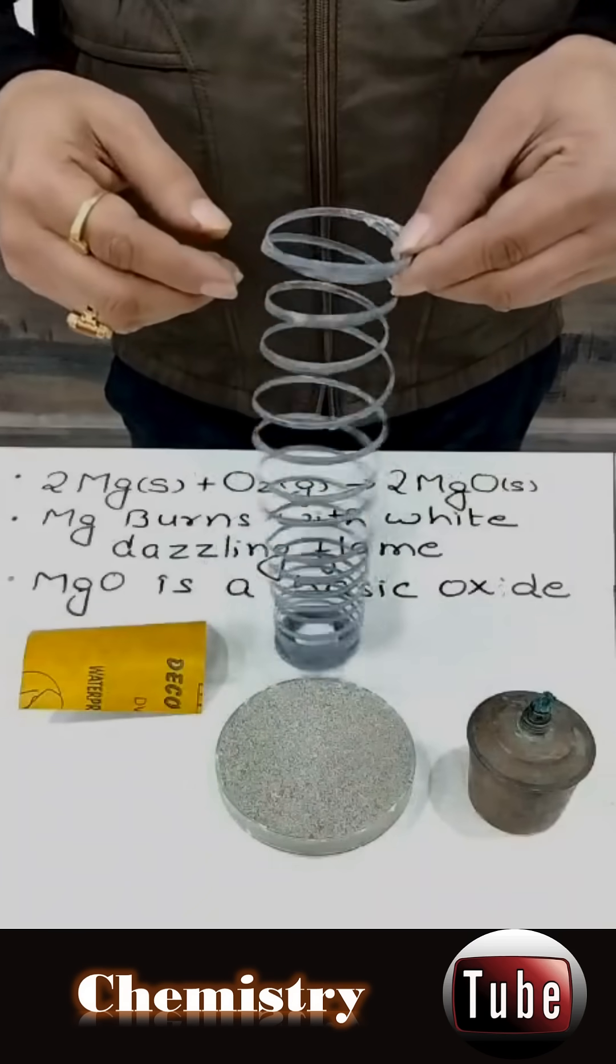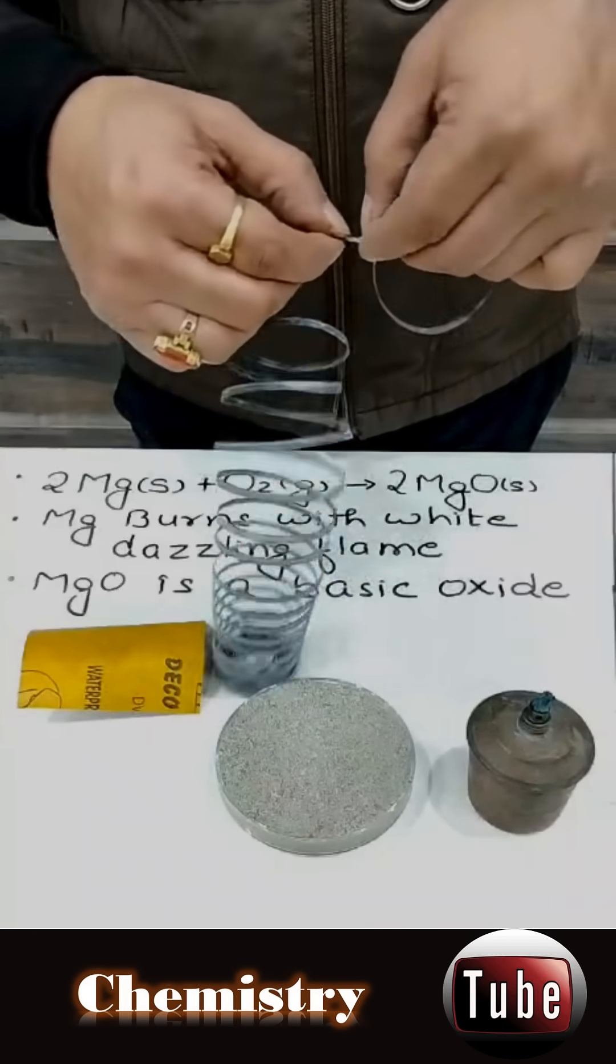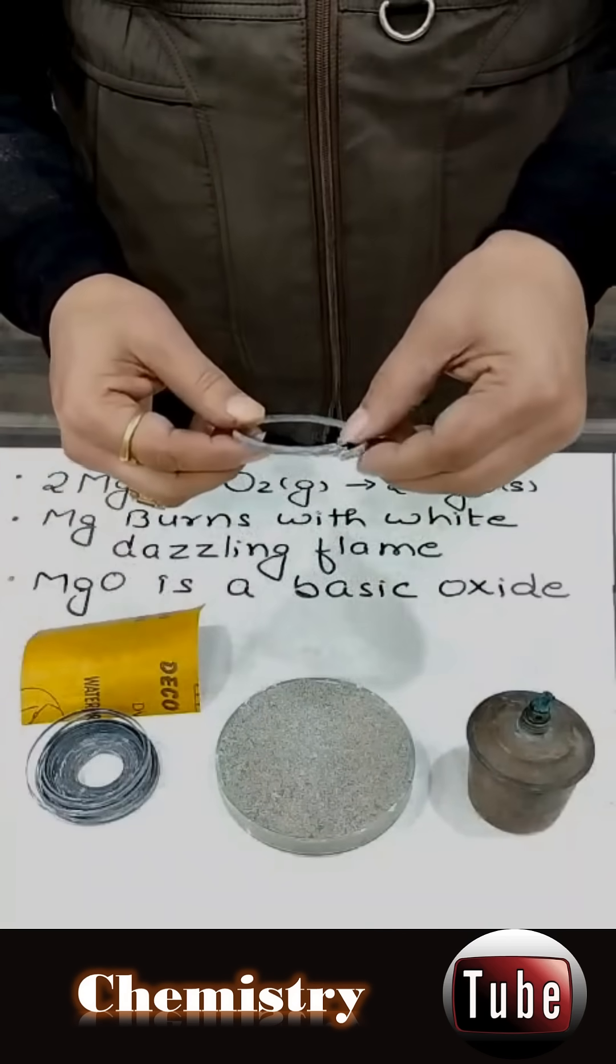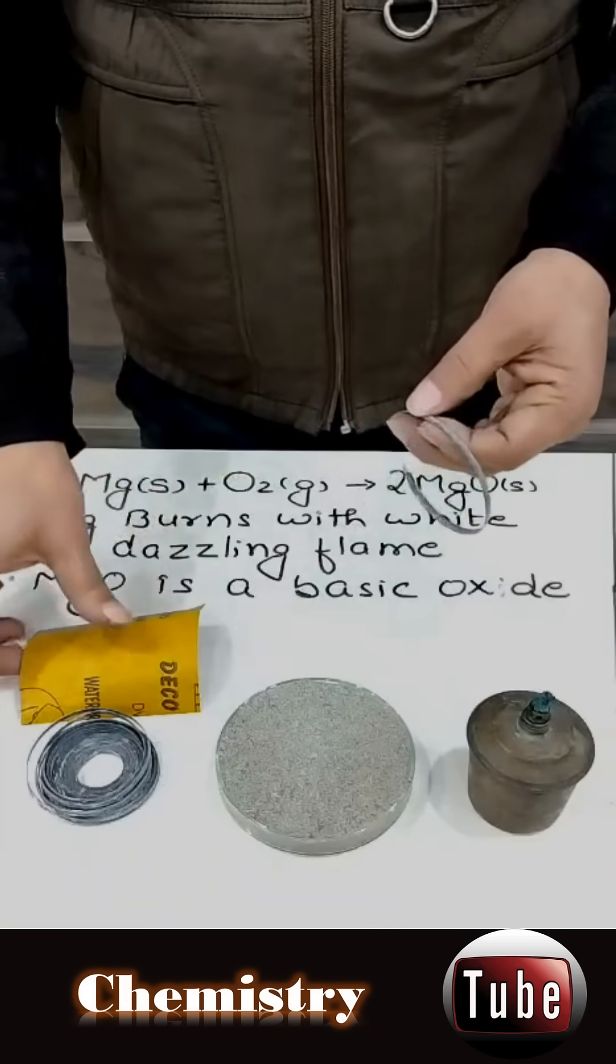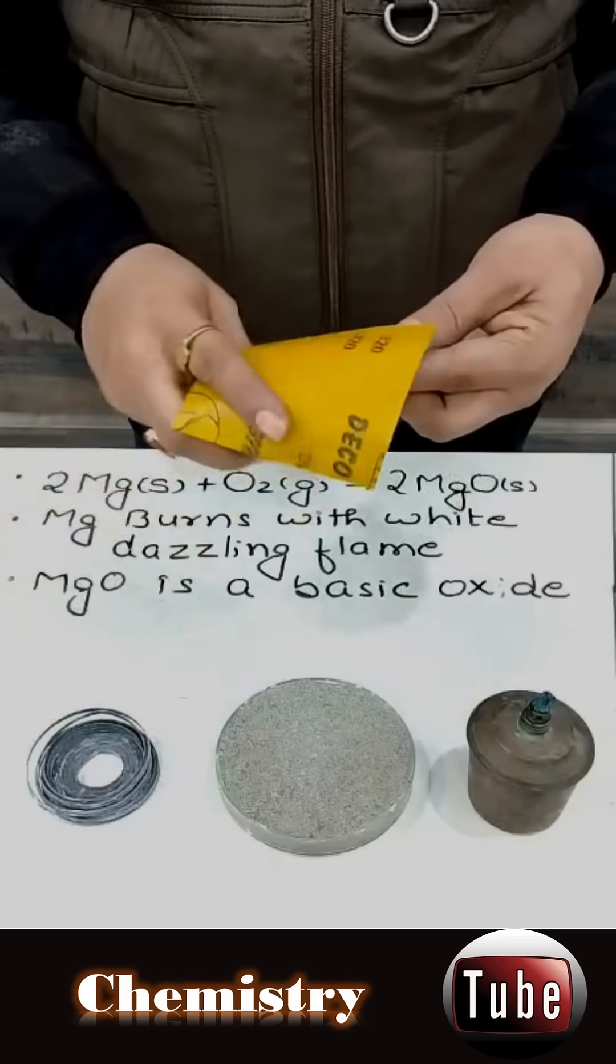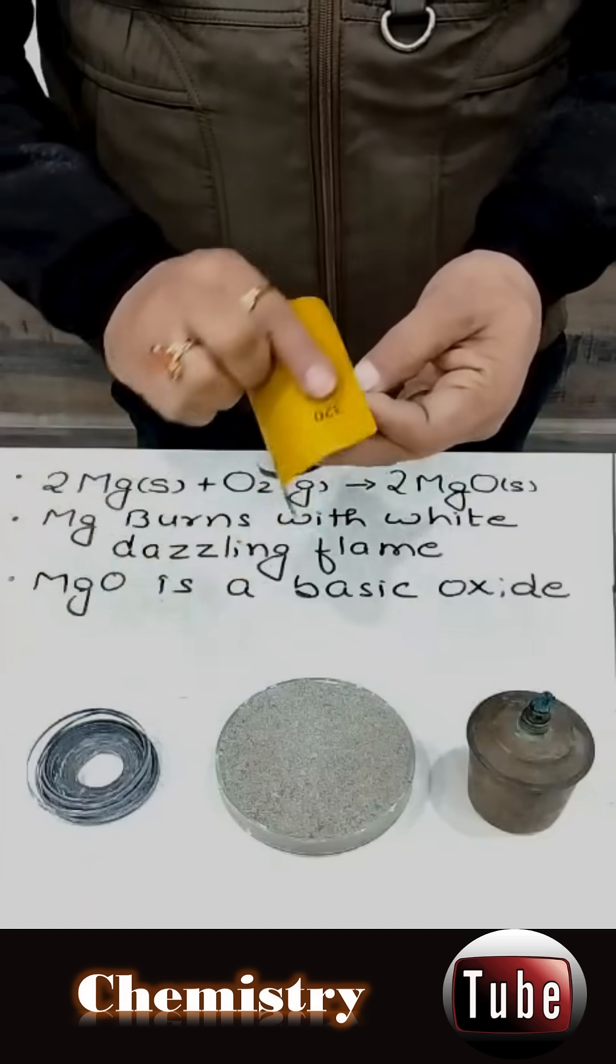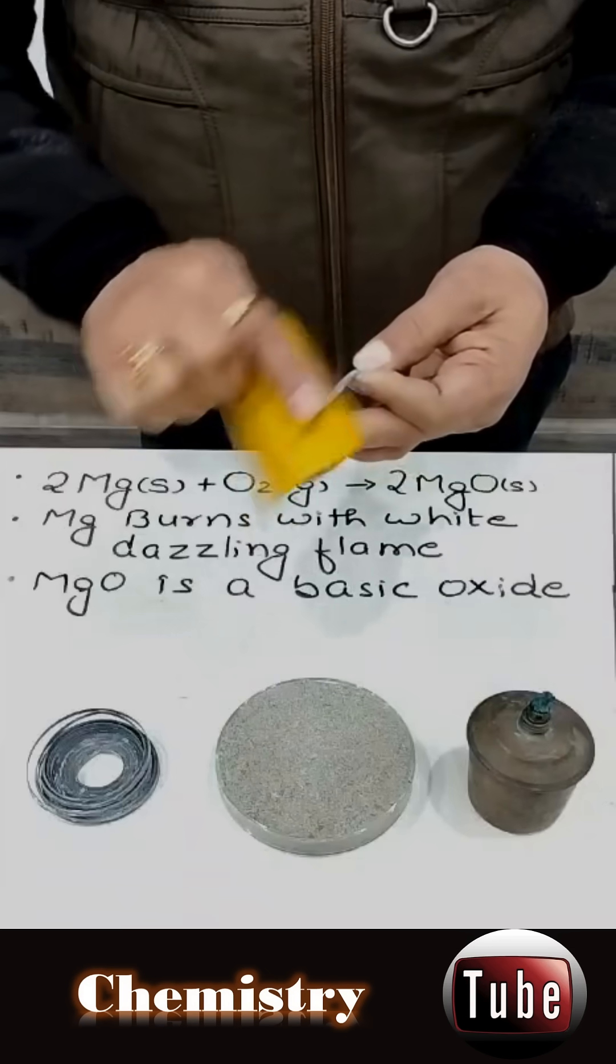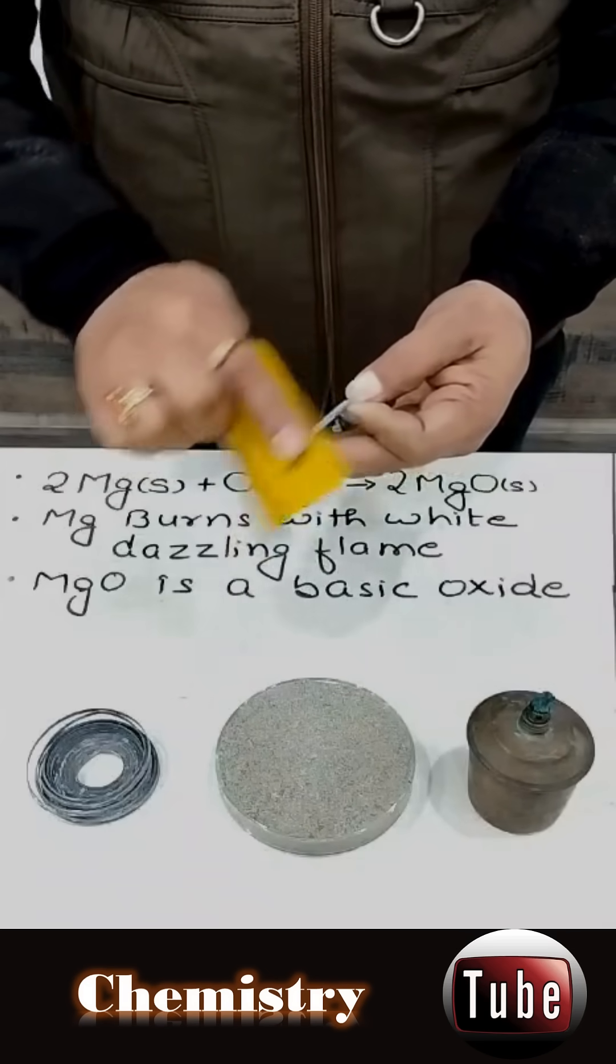First of all, what we will do, we will take a small piece of magnesium ribbon. You can cut it with the help of your hand. Now, you will take a sandpaper and you will rub this magnesium ribbon with the help of this sandpaper so that any oxide layer which is present on the surface of magnesium ribbon is removed.